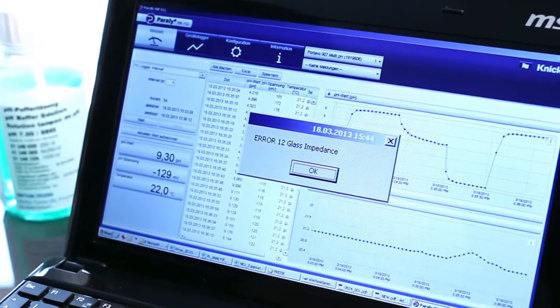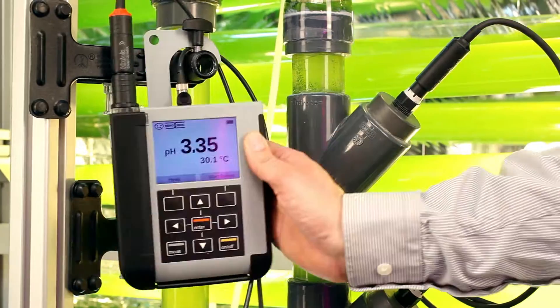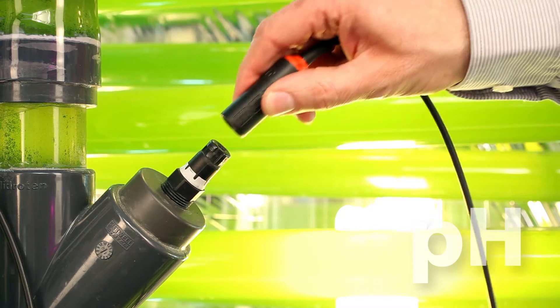An error message from the control system calls for inspecting the sensor on site. Portavo makes it possible. Plug and measure. Direct access to the measuring point.